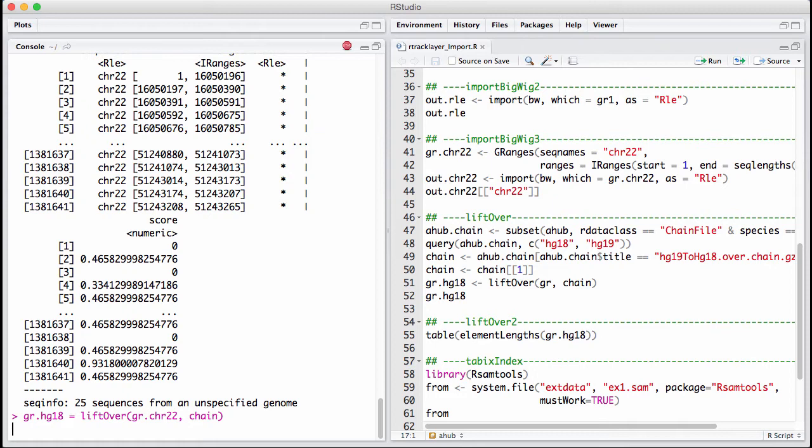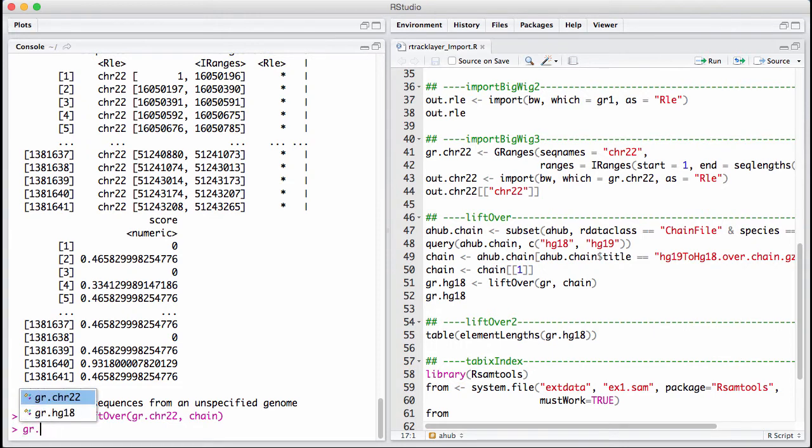There's really no check that the genomes are correct here. So you are trusting yourself to have done this correctly. Now what comes out of this? Let's do a class instead of printing it.